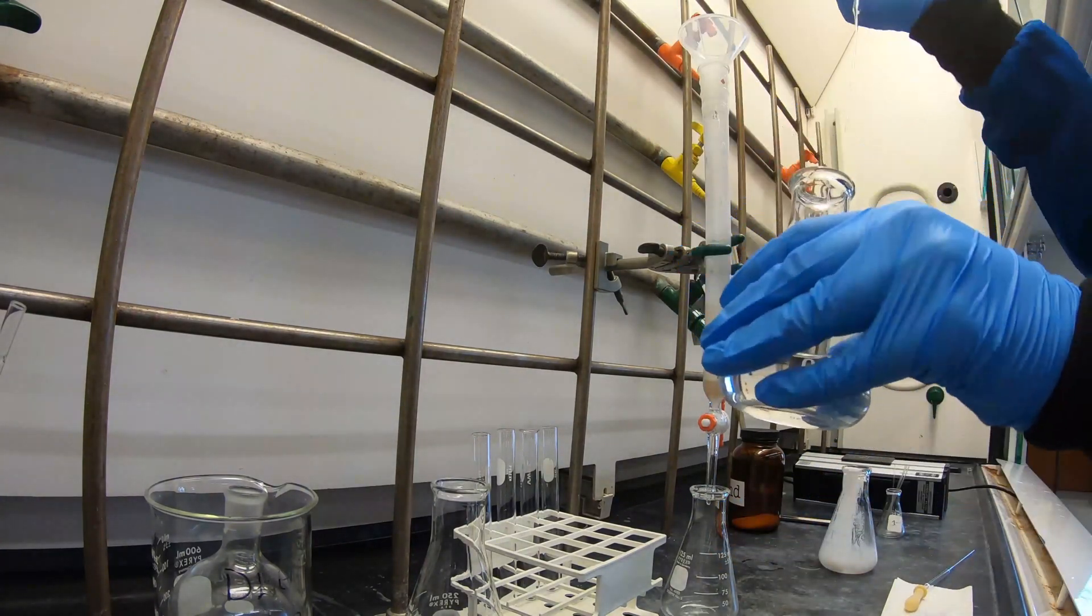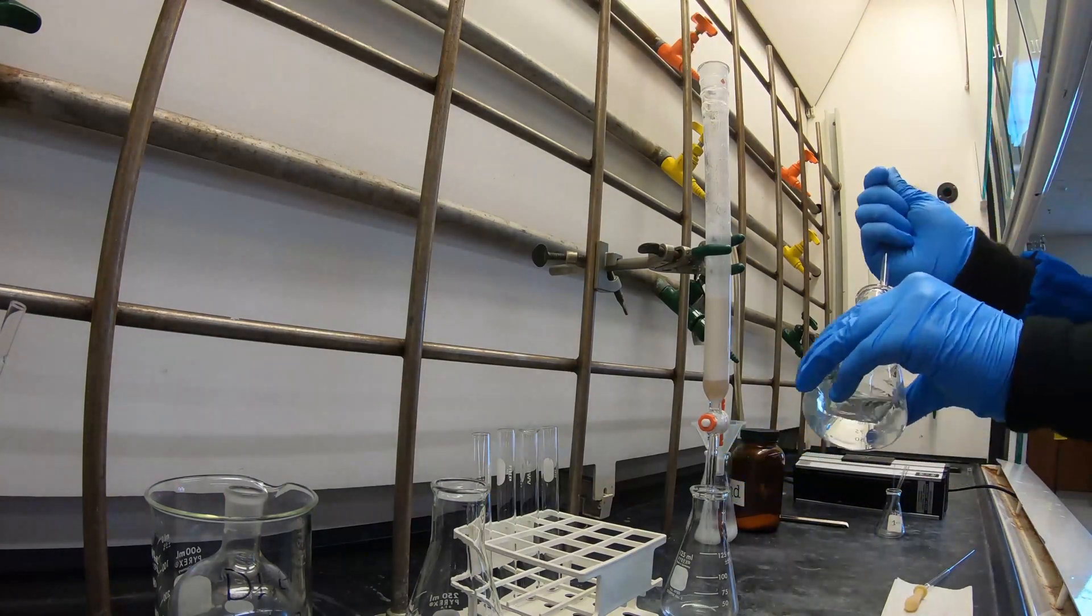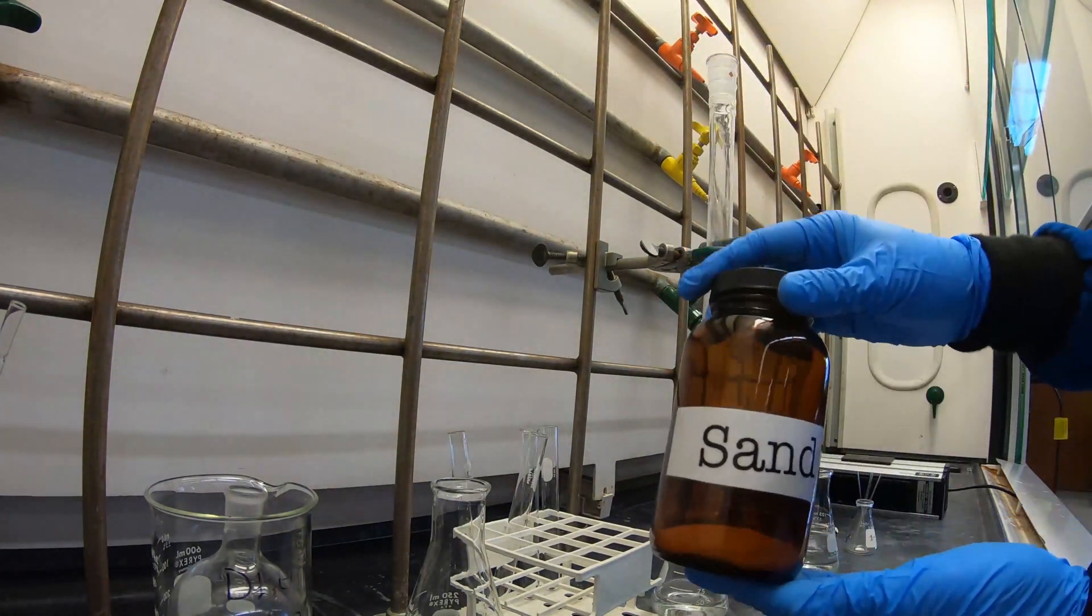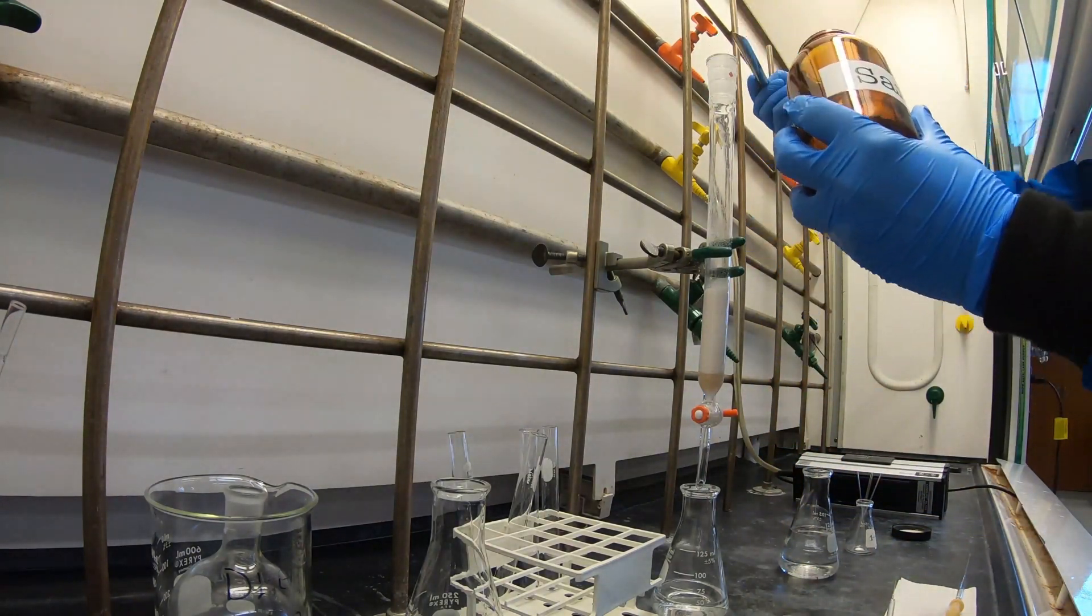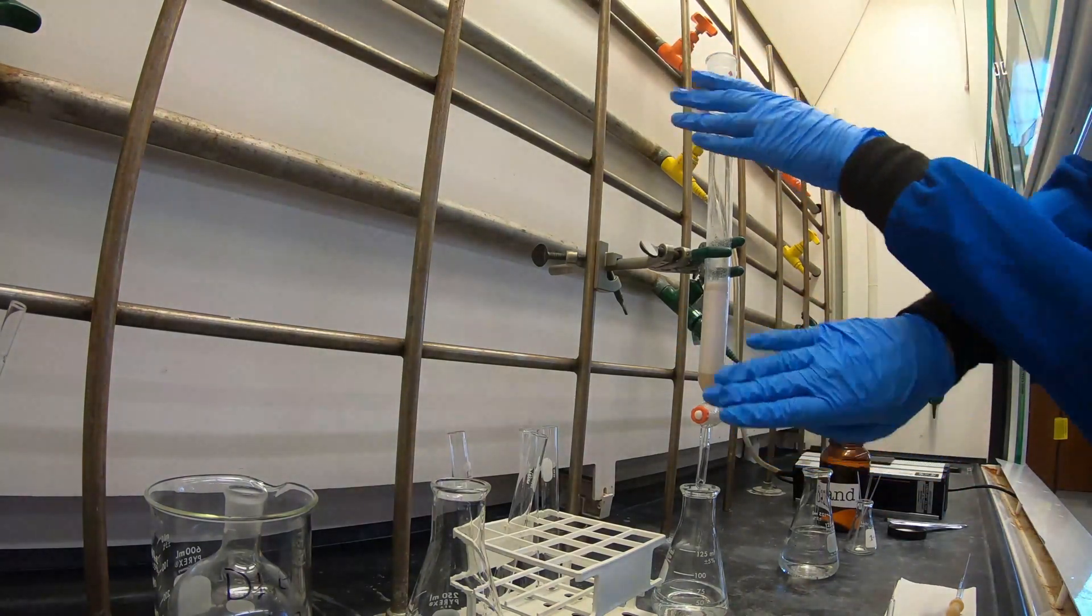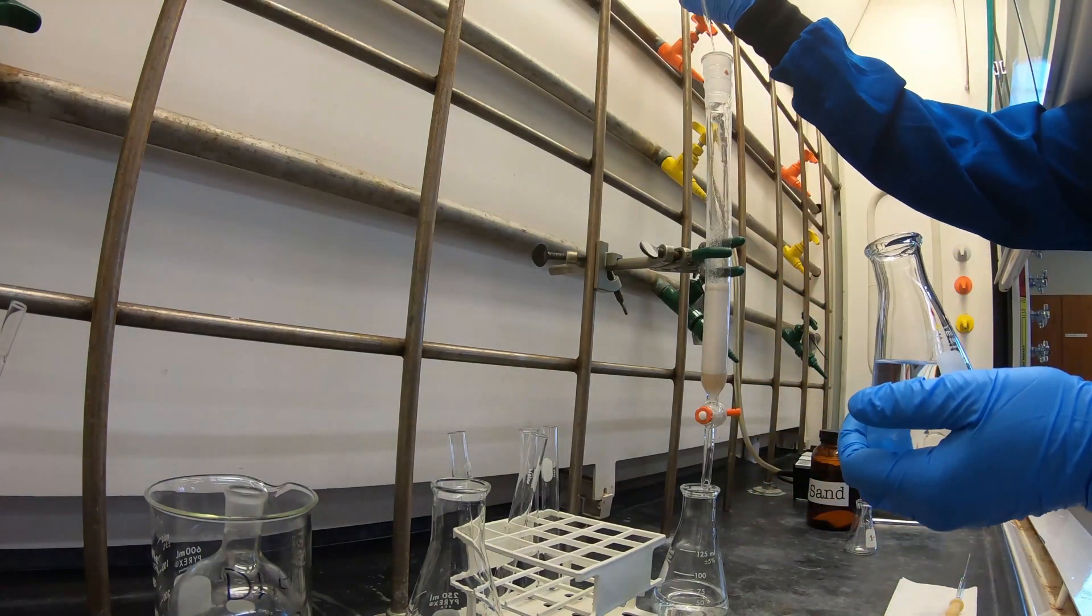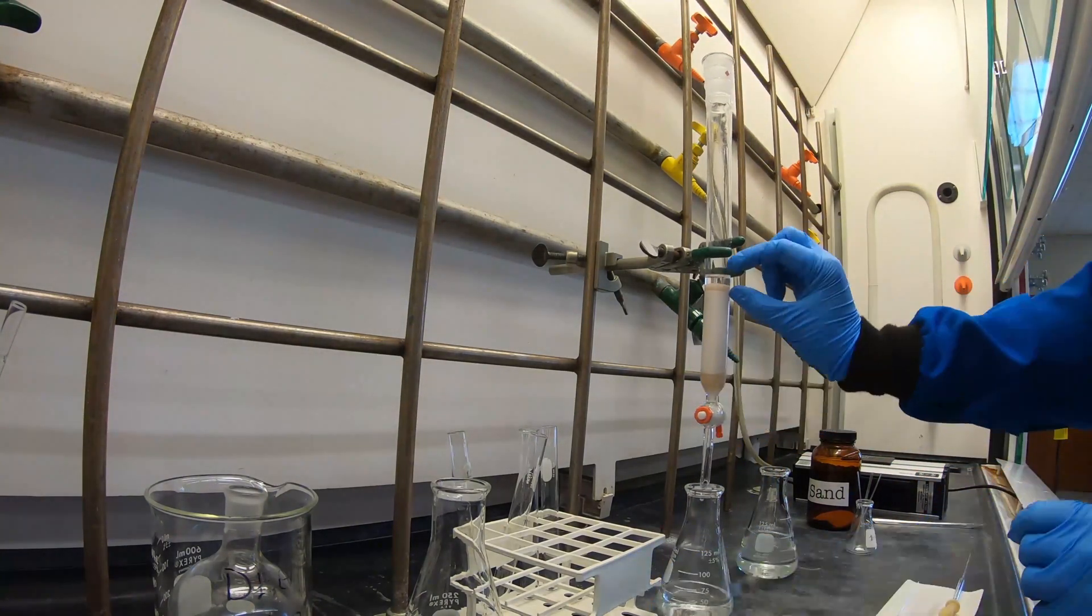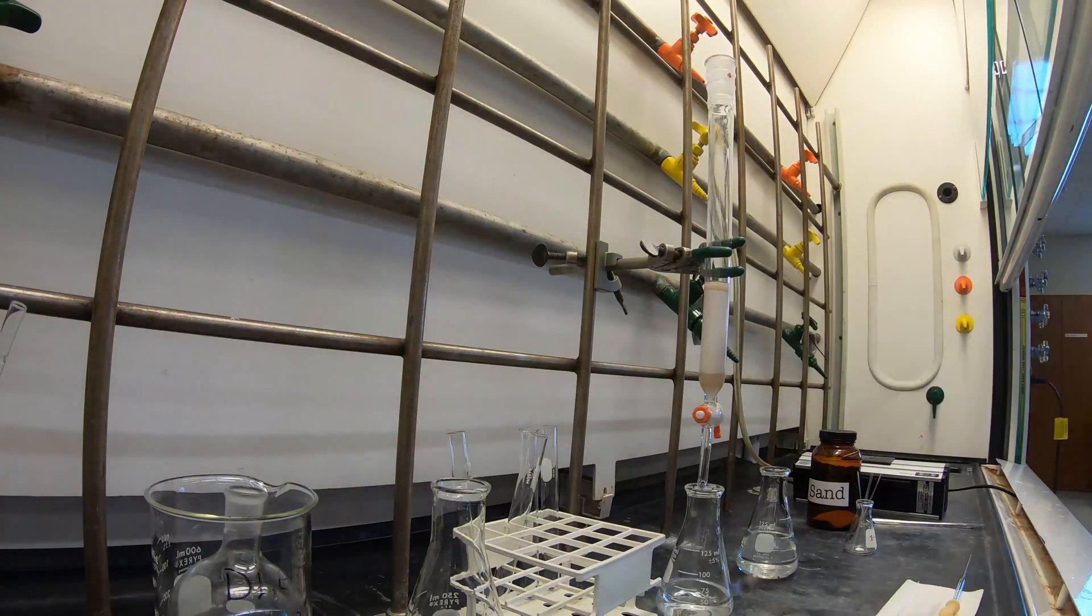Next, you're going to use hexanes to wash down the sides of the column. This can take a while. Once the sides are washed down, you're going to add a top layer of sand until you're about a half a centimeter thick. Again, tap the column until your levels are flat. Wash again with hexanes. And then you wait until your hexane solvent has drained and you're just reaching the sand layer.